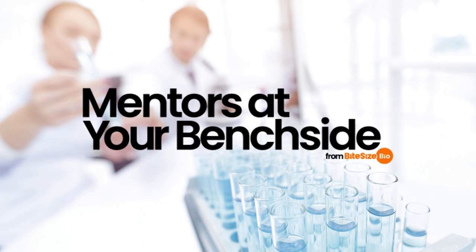It's also comparatively information poor. Next generation sequencing methods such as the Illumina dye method offer genome-wide sequencing data. And Sanger sequencing is the incumbent method for plasmid sequencing, a fundamental service required by almost all biology research labs. Partly because of these drawbacks, and partly because of the intrinsic limitations of the technique, Maxam Gilbert sequencing cannot compete with these methods. So what is Maxam Gilbert sequencing used for today?